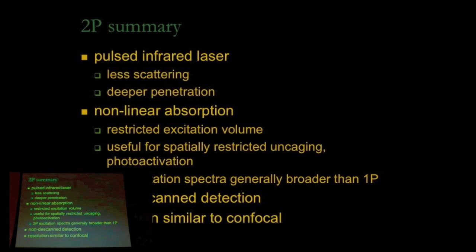With these, it's infrared. You can turn it up and you can boil the tissue very quickly if you're not careful. So you can get too much light in there too. A couple points are that, certainly, bluer light is more toxic to tissue. Obviously, you don't want to go into the UV.